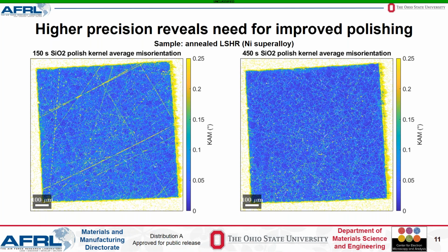And sort of connected, when using SHI versus the conventional Hough indexing to show lower misorientation with KAM, how valid is the process? How valid is the data? And can you confirm that your misorientation is that low with techniques like neutron diffraction?